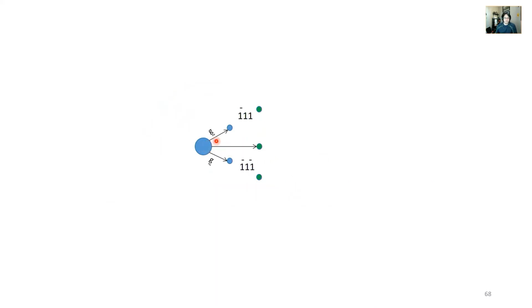Well, we have our friend. We realize that this is the reciprocal lattice vector, okay? The k vector is coming out of the screen for your reference if you want to stay in the vector world. And so this one can be found by the vector addition of the 2 adjacent reciprocal lattice vectors. And so -1 plus -1 is -2. 1 plus 1 is 2. 1 plus -1 is 0. So this spot is -2, 2, 0. And don't get thrown off by my poor alignment.